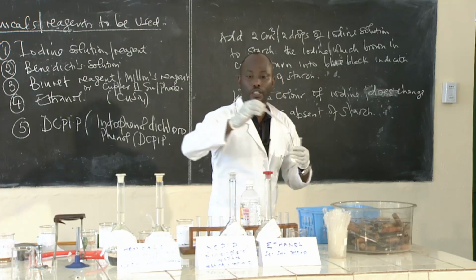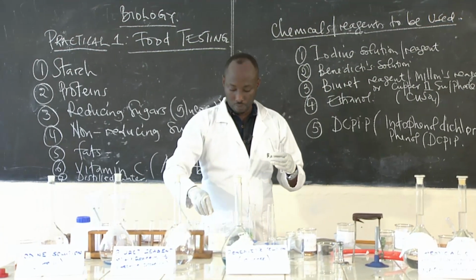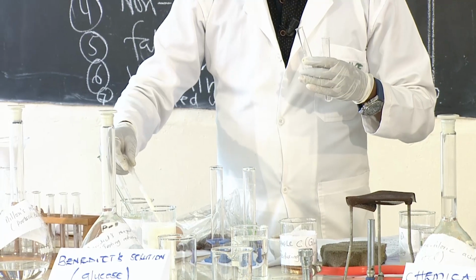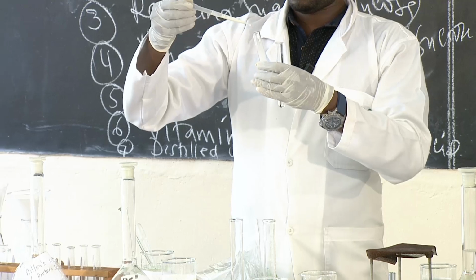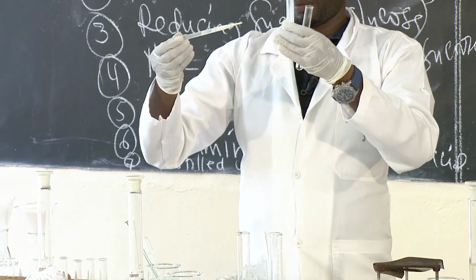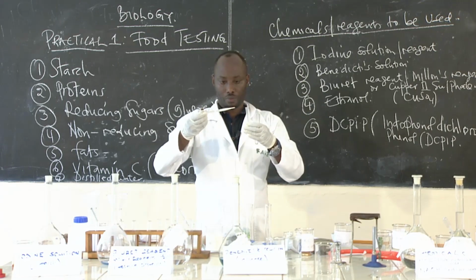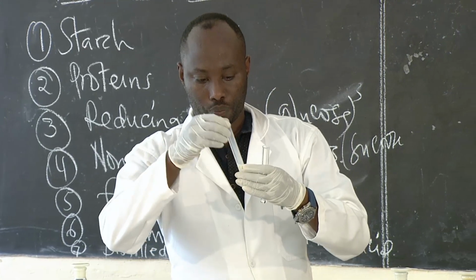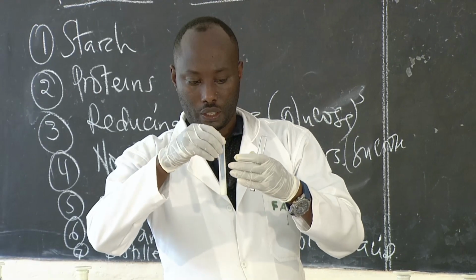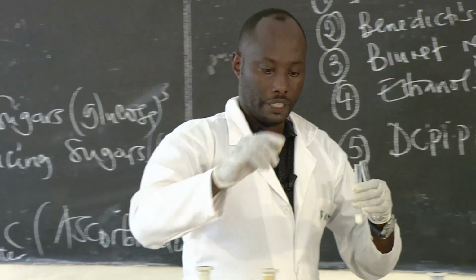Let me see, am I sure that milk contains proteins? Let me just repeat the experiment, I think. There's no need of repeating the experiment. I think I can add the Biuret solution.